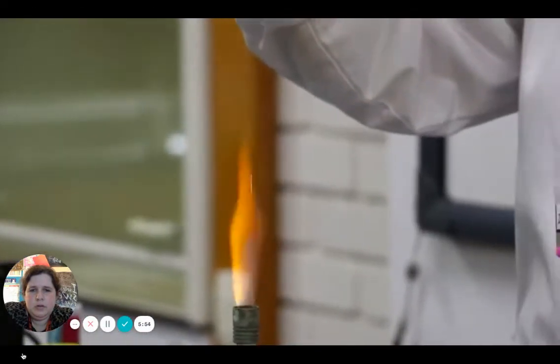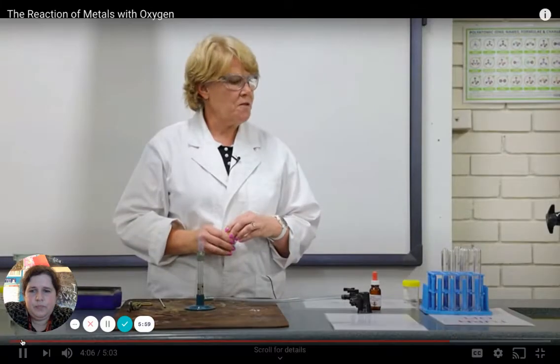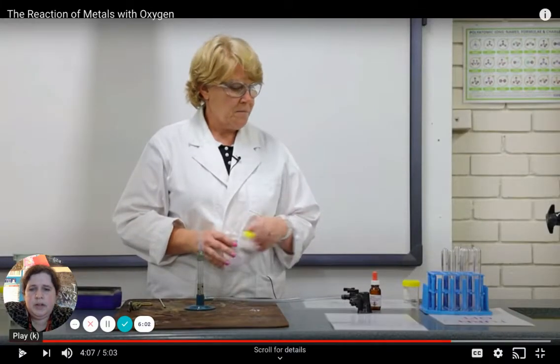Oh, do you see the sparks? The iron will ignite much more readily when it has higher surface area. So if you recall when I did the flame test lab back in October, I did one of them and it made like a sparkler. That was iron filings. So that's what she just put into the Bunsen burner that created those sparks. And basically what it says is that if you shave it down into smaller pieces and you put more of those pieces in there, it reacts a lot faster, and so you'll notice a bigger change immediately.